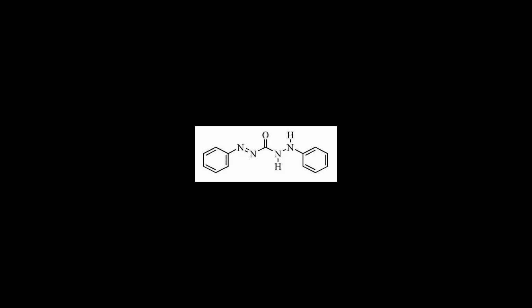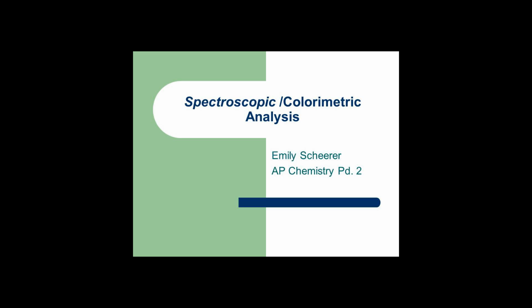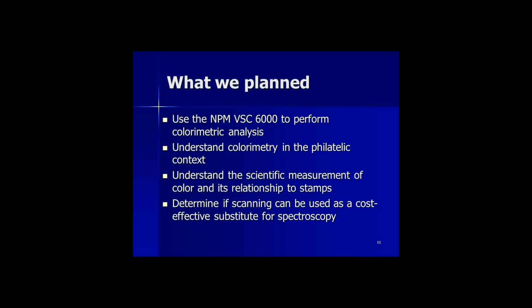The method is widely used in medical laboratories and for industrial purposes, e.g., the analysis of water samples in connection with industrial water treatment equipment. The equipment required is a colorimeter, some cuvettes and a suitable color reagent. The process may be automated, e.g., by the use of an autoanalyzer or by flow injection analysis.